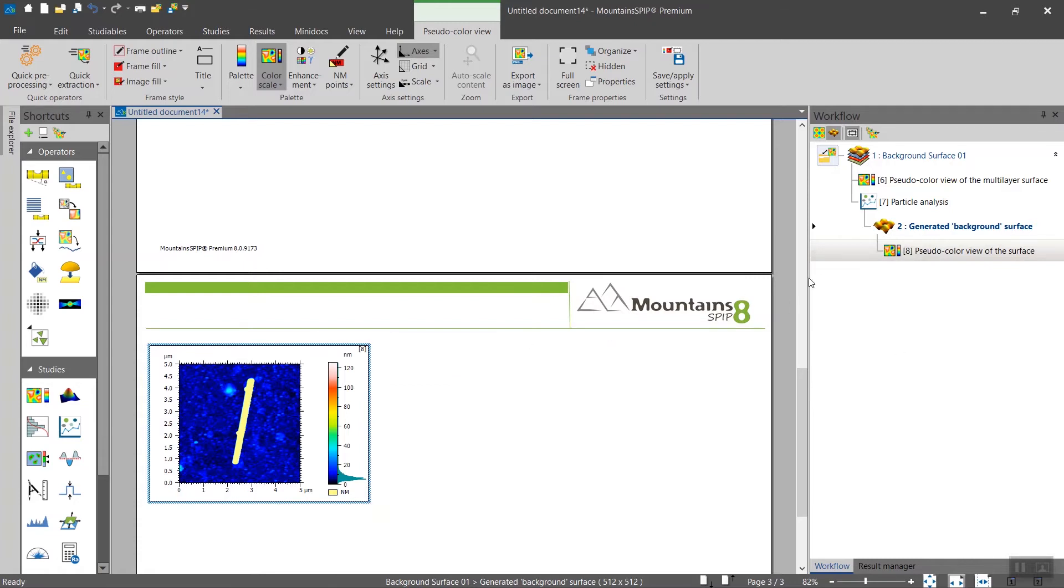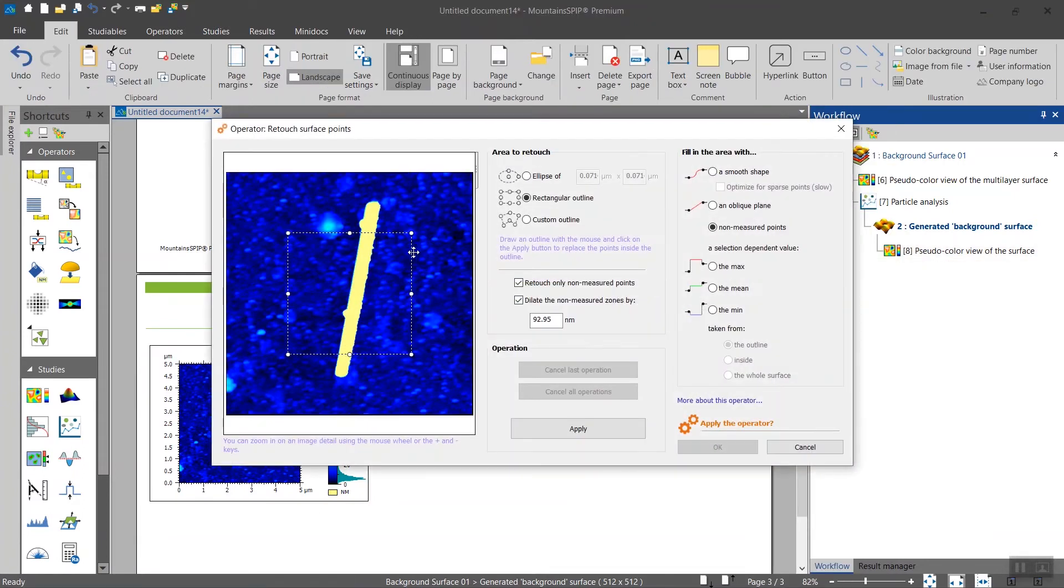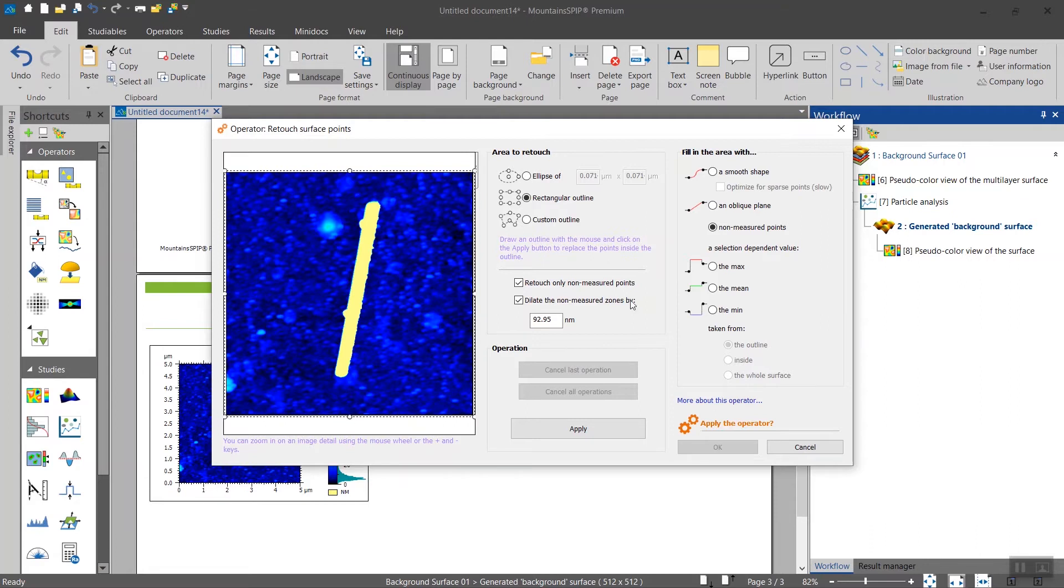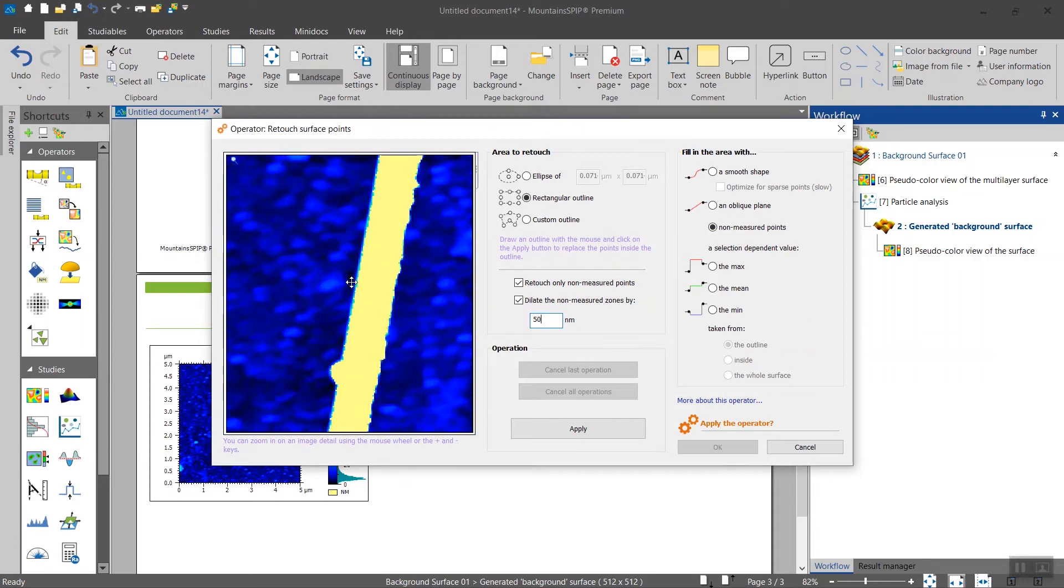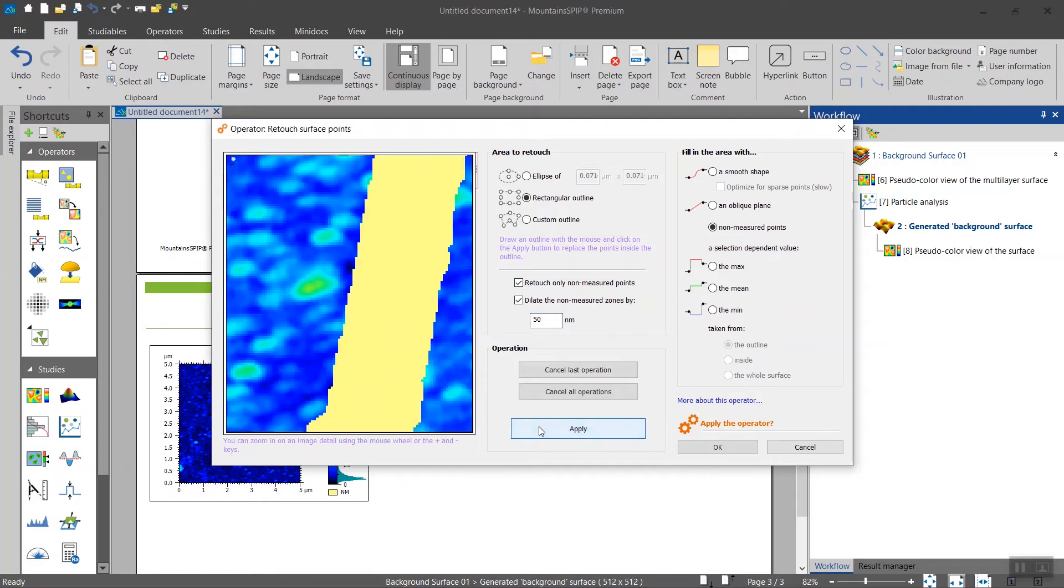We will insert an operator in the workflow called retouch. The idea is we want to only touch the non-measured points in yellow. Here we want to dilate them 50 nanometers, and we want to replace these regions by more non-measured points, so we're not adding points, we're removing part of the surface. If I zoom in, you will see I click on apply and you see that these regions here have been eroded.